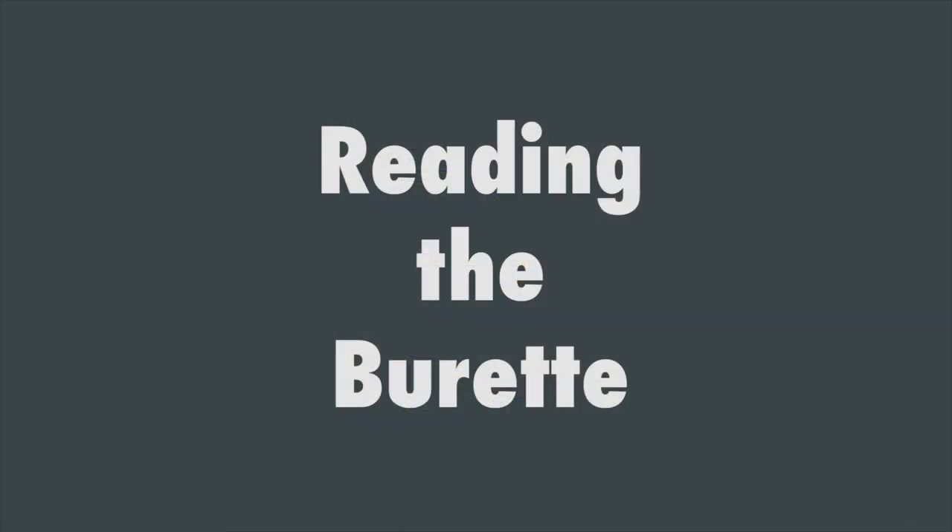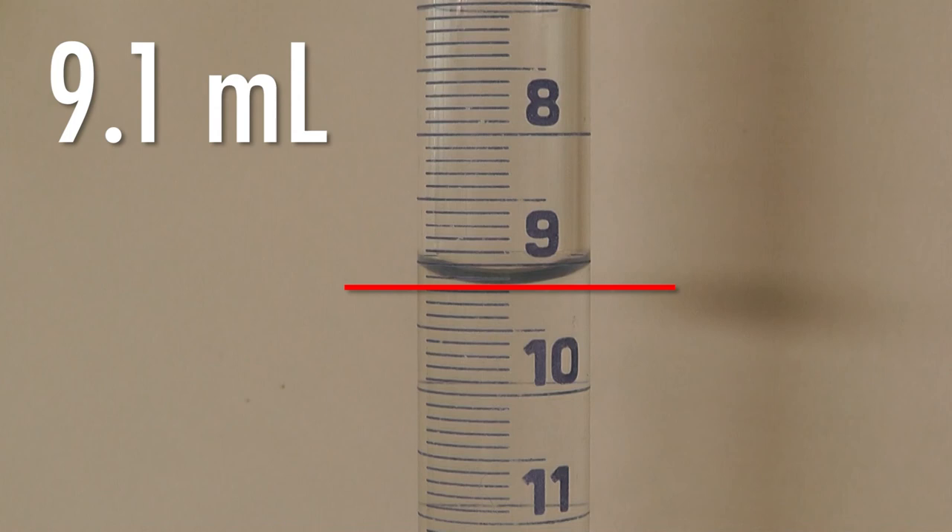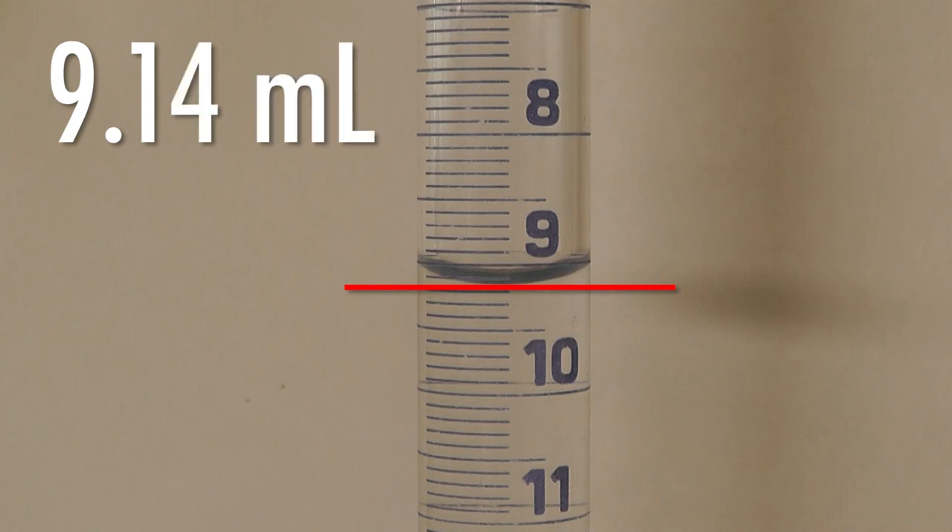You're now ready to take a reading. With the meniscus at eye level, find the nearest mark on the burette. This will give you the volume to one decimal place. You will have to estimate the second decimal place. This burette, for example, reads 9.14 milliliters.